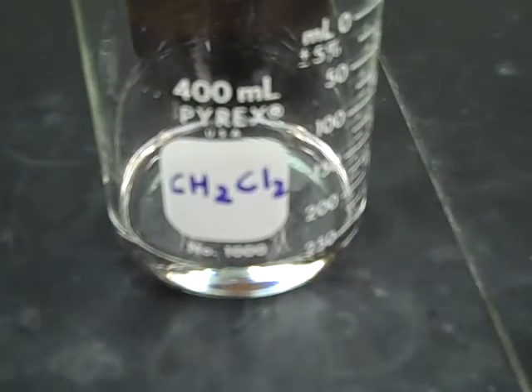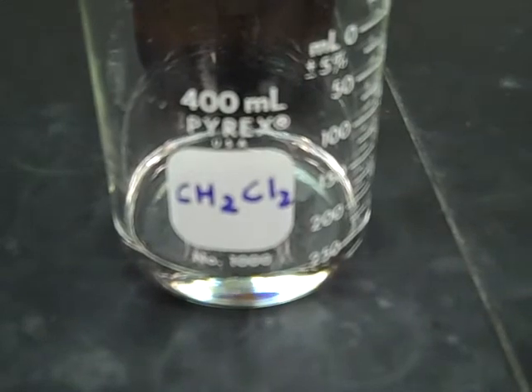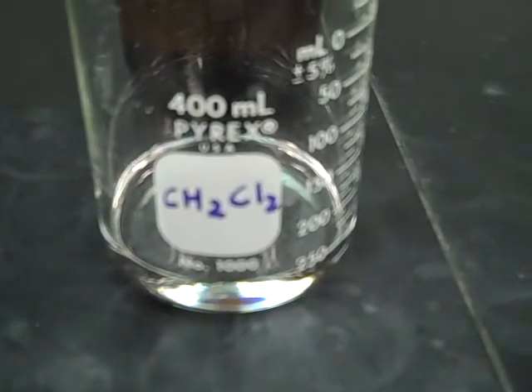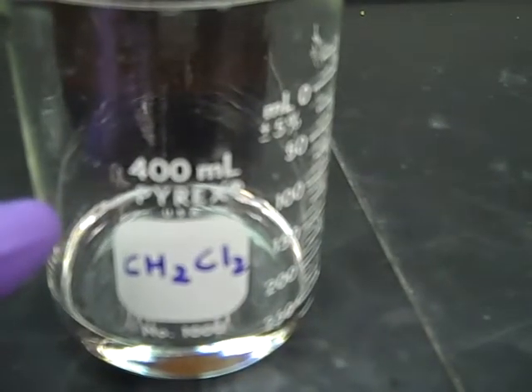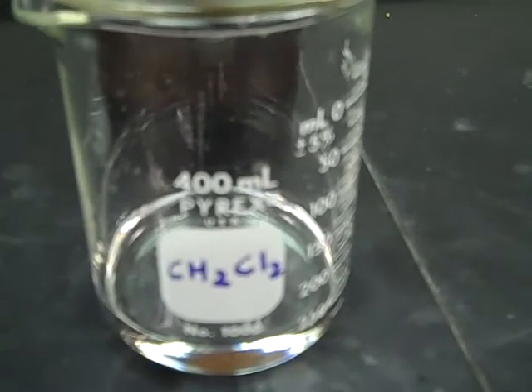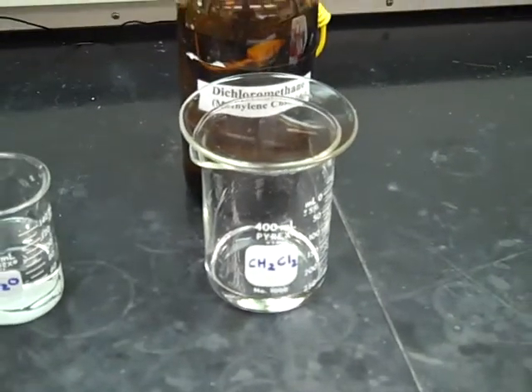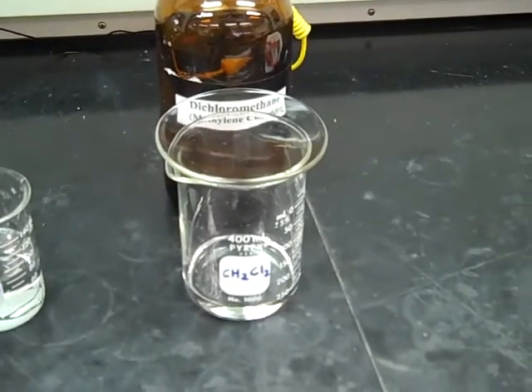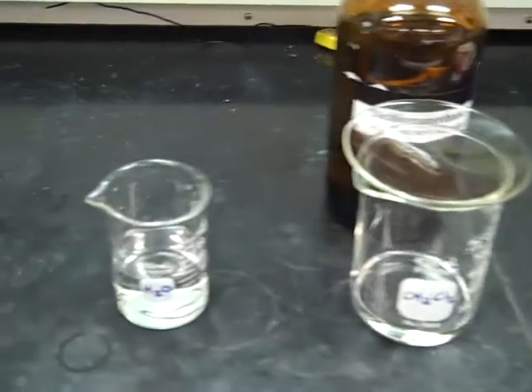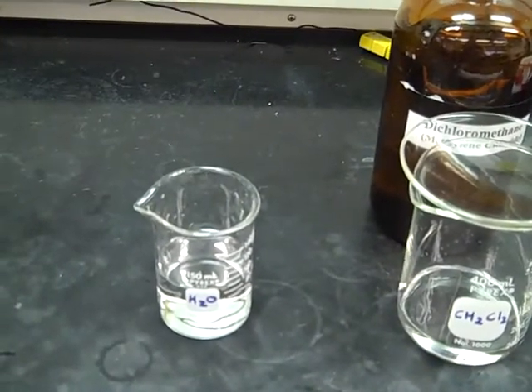So here we've got an organic layer that has dichloromethane, CH2Cl2, and then we have an aqueous layer, H2O. So in our organic layer is an organic product. But there also may be some aqueous byproducts or other materials that we could extract away from that organic layer into the aqueous water layer.